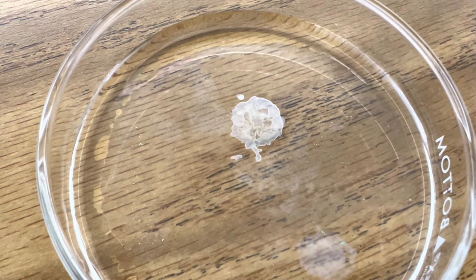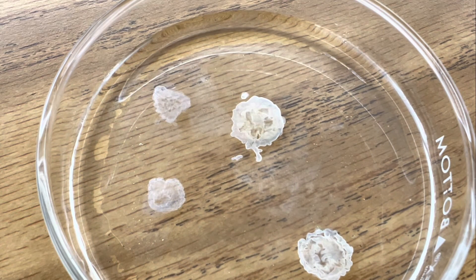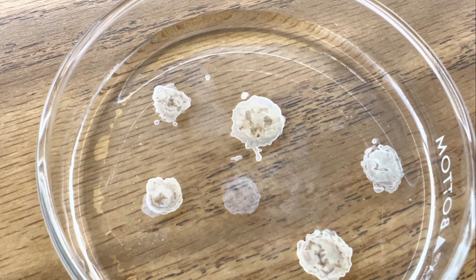It almost looks like a flower blooming. Here's another drop. That is awesome. Here's another drop. Beautiful precipitate of manganese hydroxide. I think I like it in a petri dish better — that is so dramatic.